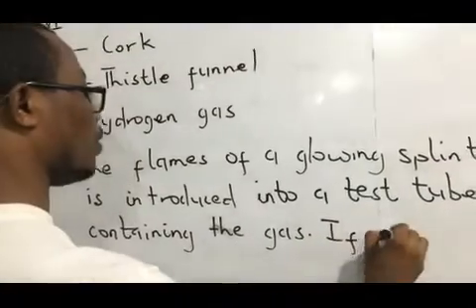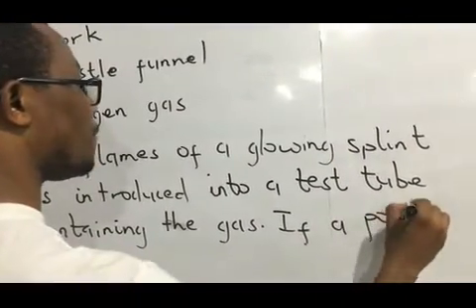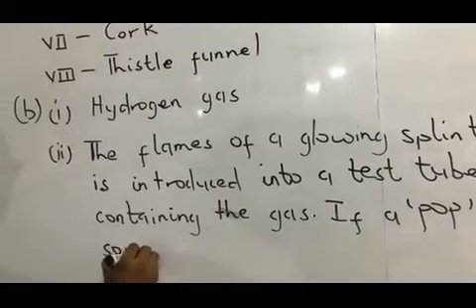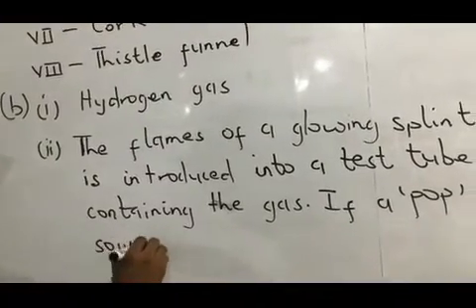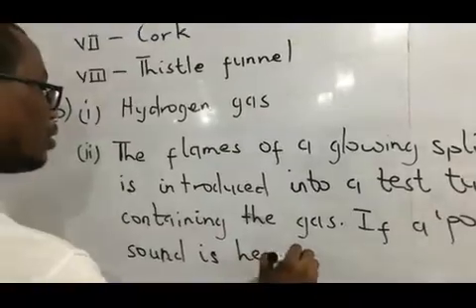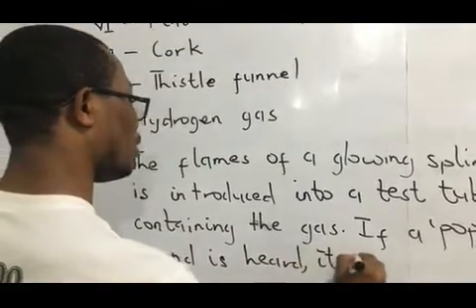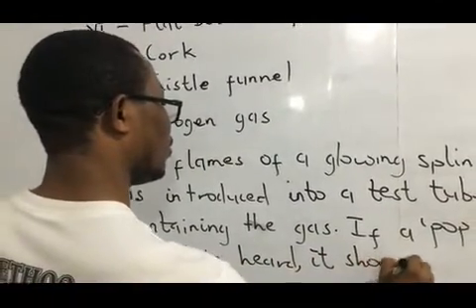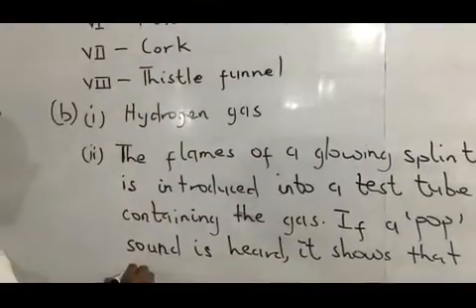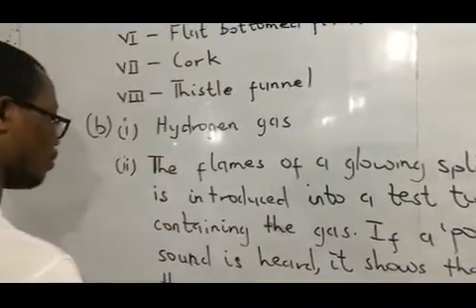If a pop sound is heard, it shows that the gas is hydrogen gas.